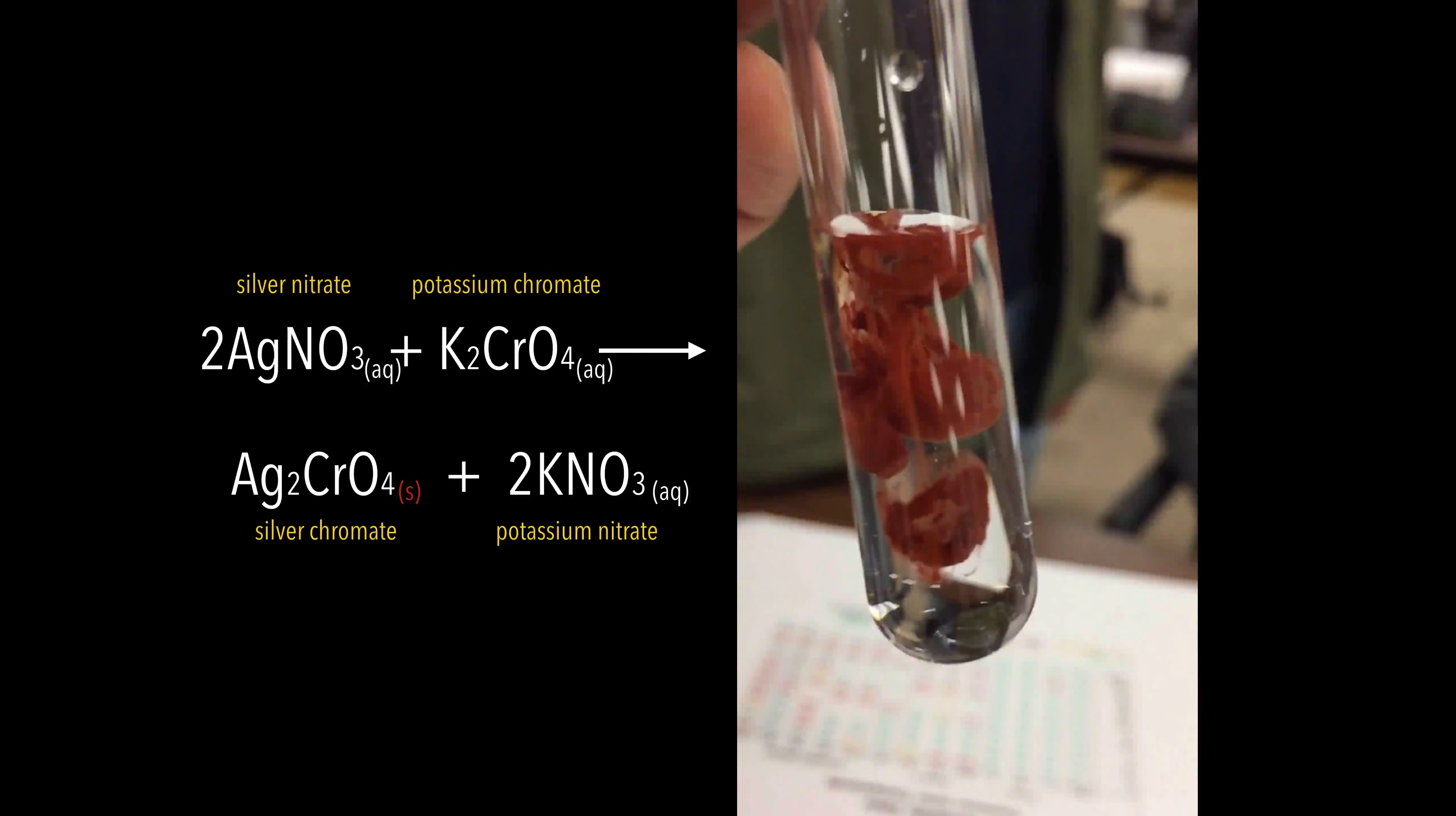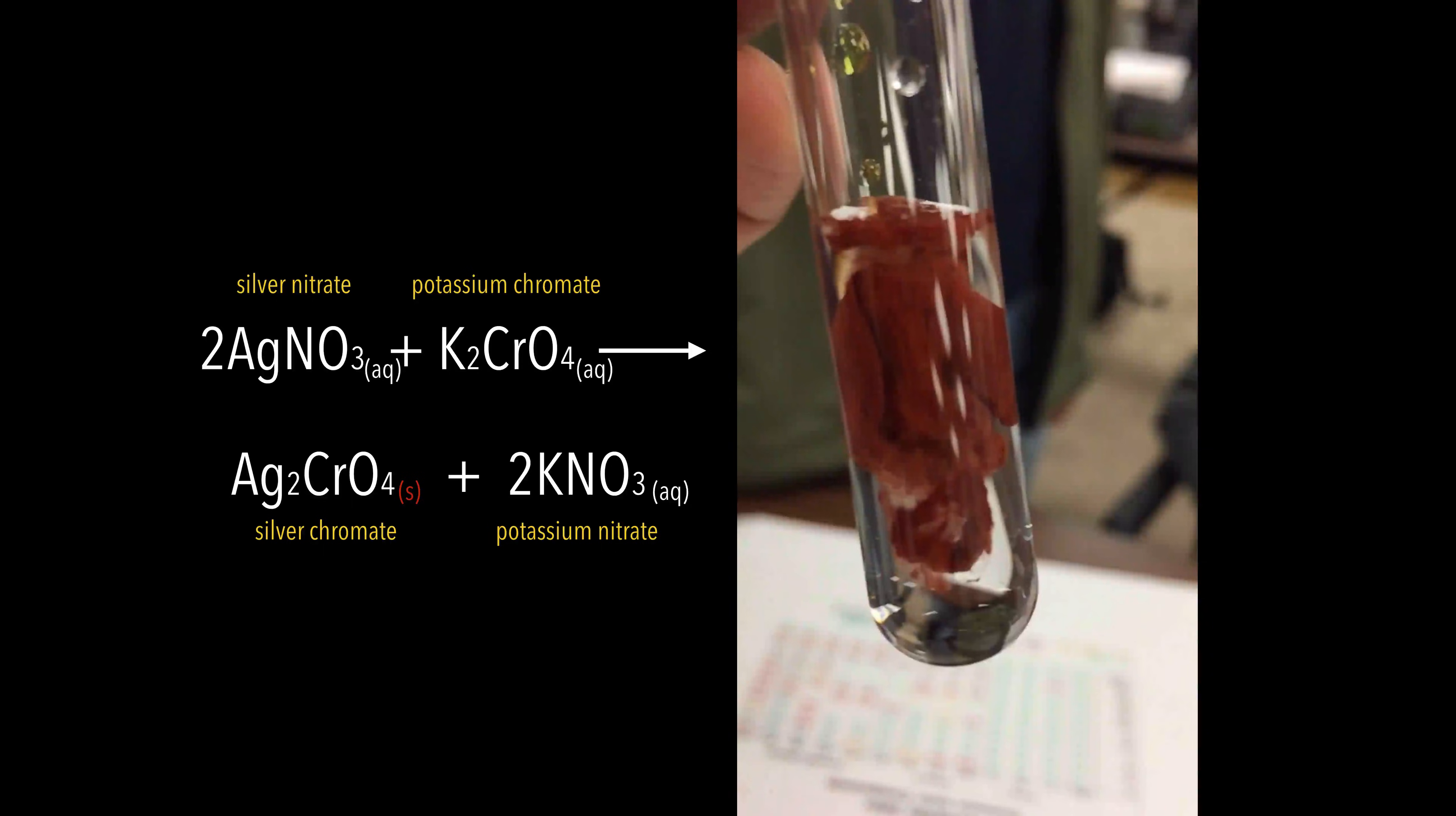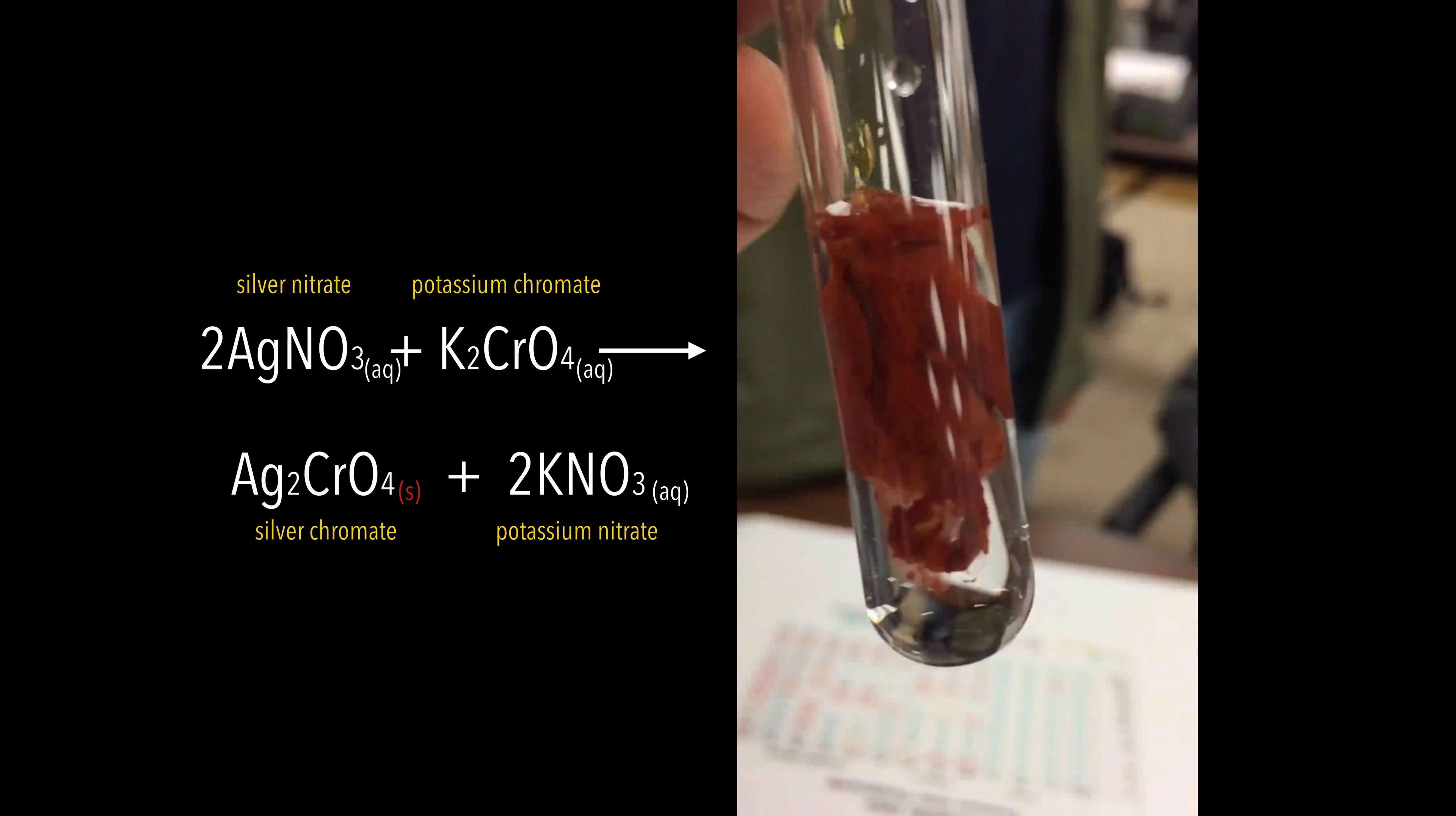Looks pretty cool. Looks like some reddish clouds that are forming. But that's actually a solid or precipitate. The potassium nitrate is a spectator ion. They are not actually involved in this reaction.